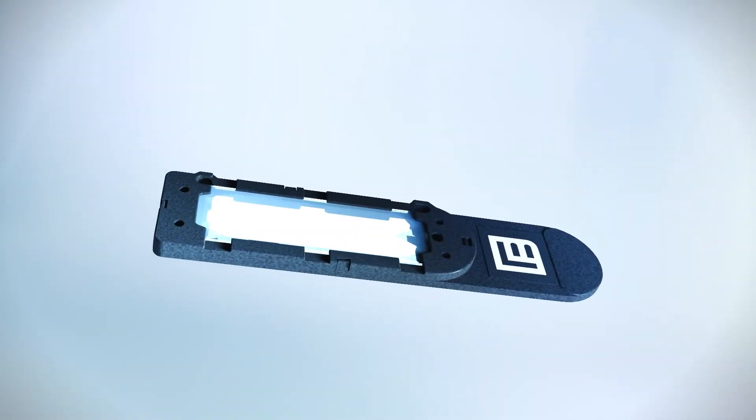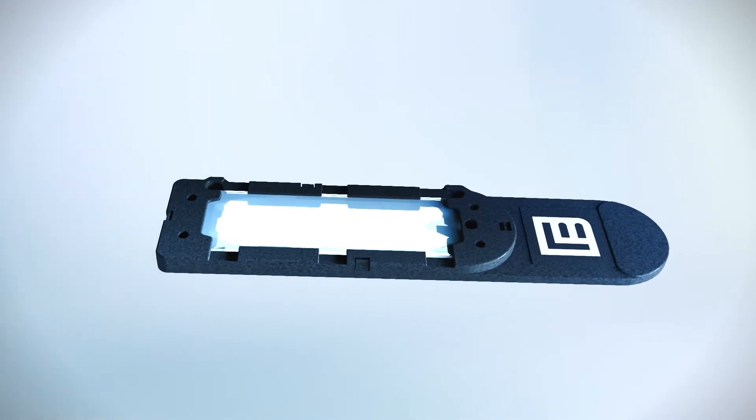Aviti is built upon Element's new proprietary methodologies in chemistry, imaging and data analysis.